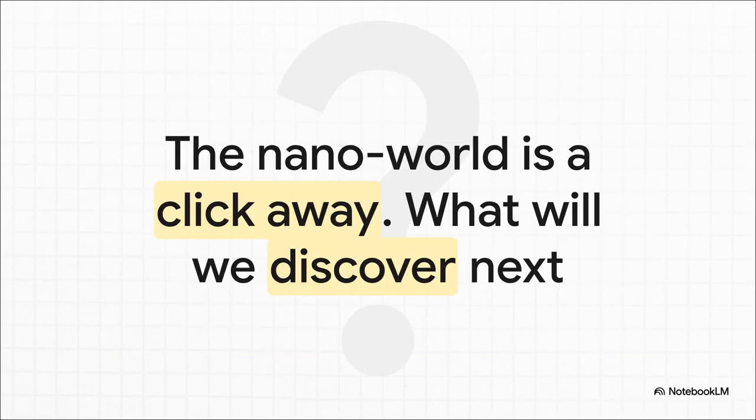So what this all means is that the nano world is no longer some far-off place, locked away in an expensive lab. It's here. It's accessible. It's for students, for teachers, for scientists, for anyone with a curious mind and an internet connection. It completely changes the game. So the real question isn't whether we can see the world of atoms anymore. The question is, now that it's just a click away for all of us, what are we going to discover next?